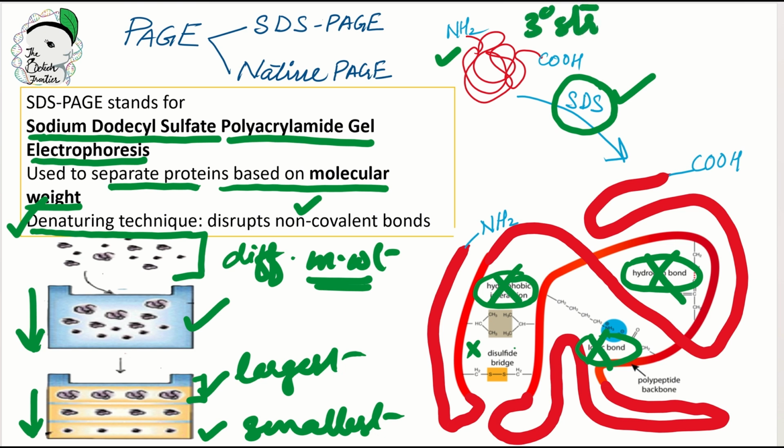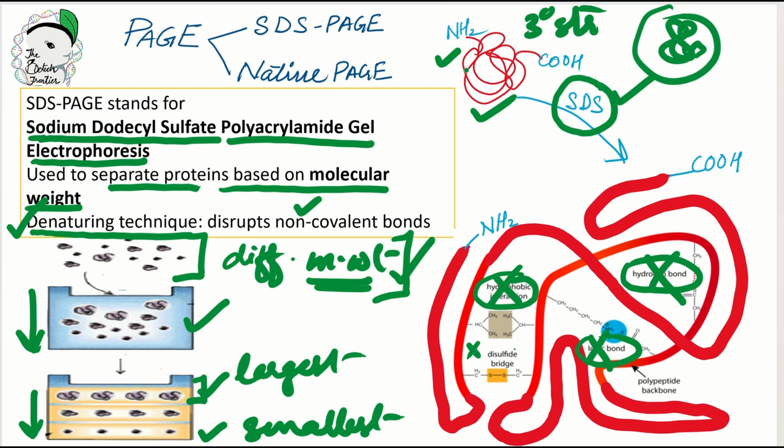In our body there are many different forms of proteins, which can give a protein different shapes, and to avoid the hindrance of shape during the separation, because here we are only supposed to separate the proteins on the basis of molecular weight, not on the basis of shape.